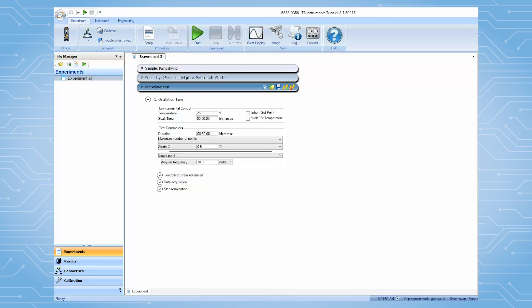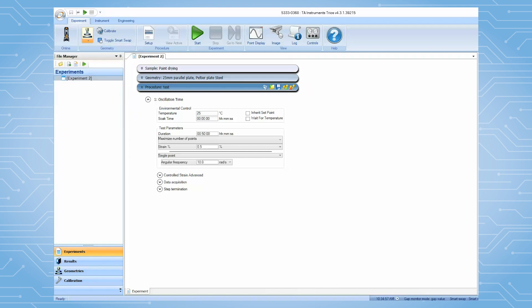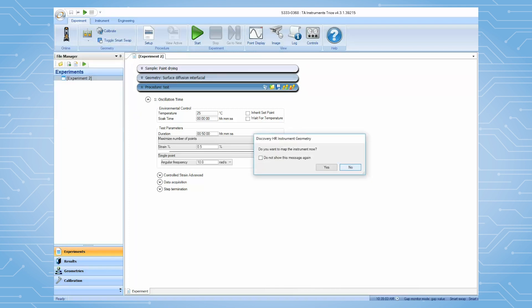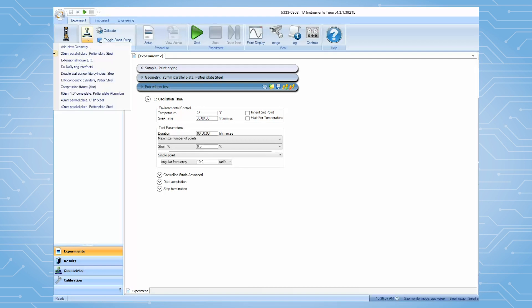From TRIO software, open the surface diffusion geometry file. If this geometry file has not been previously created, then select Add New Geometry.